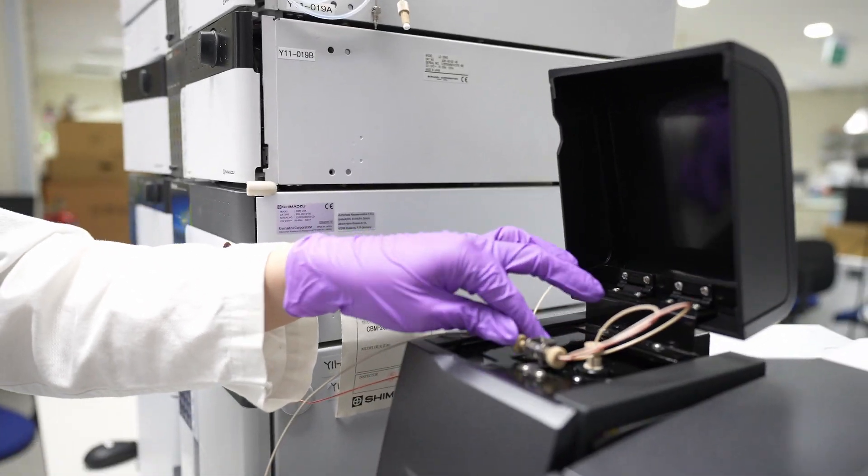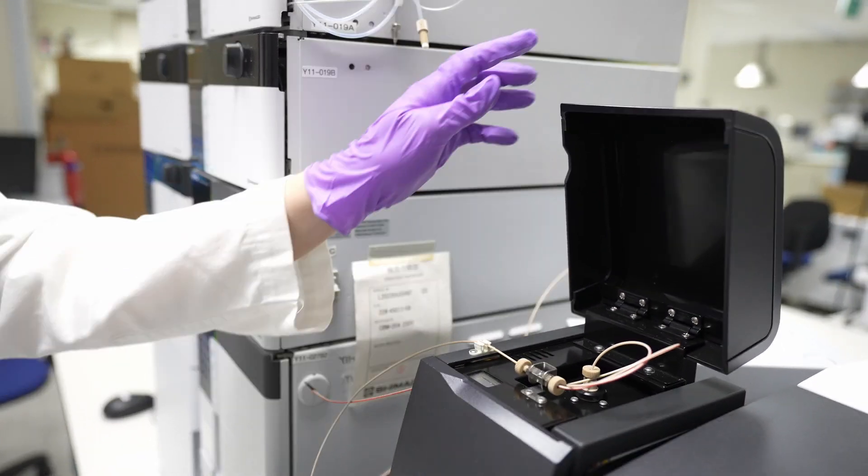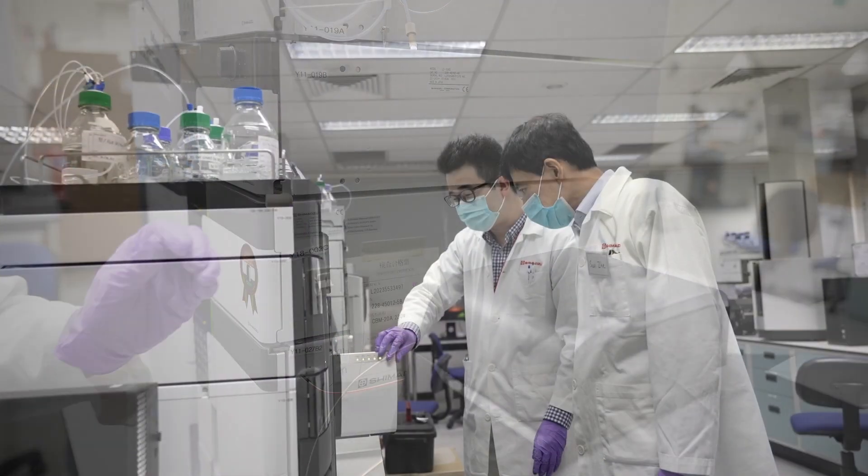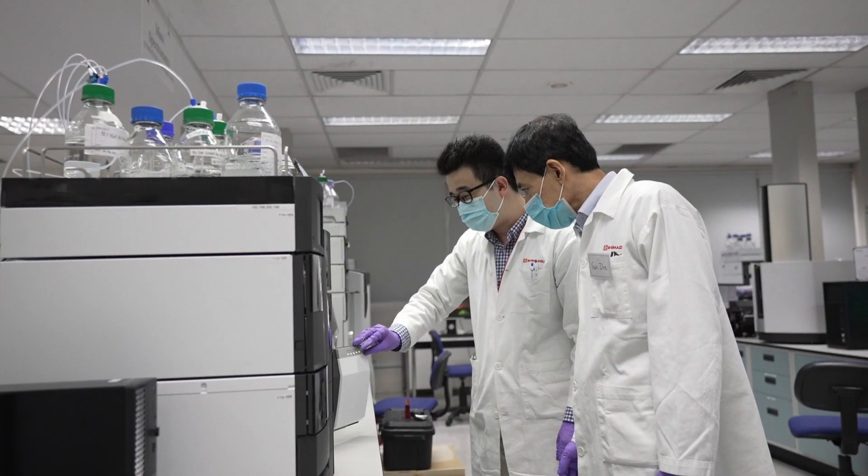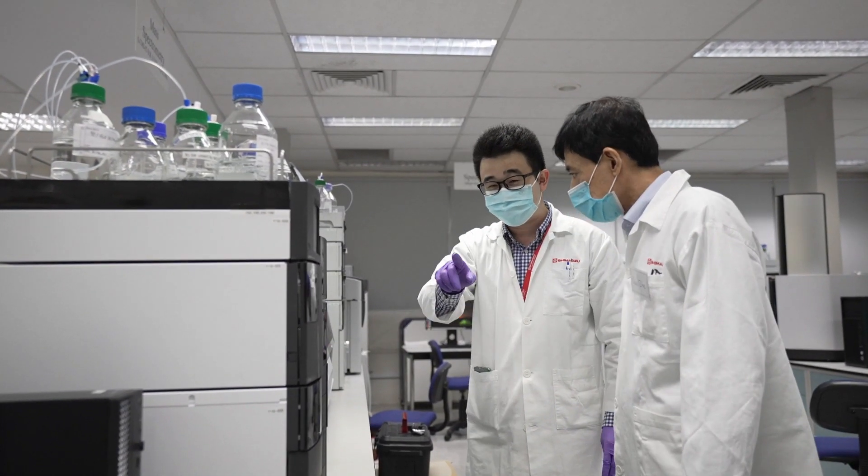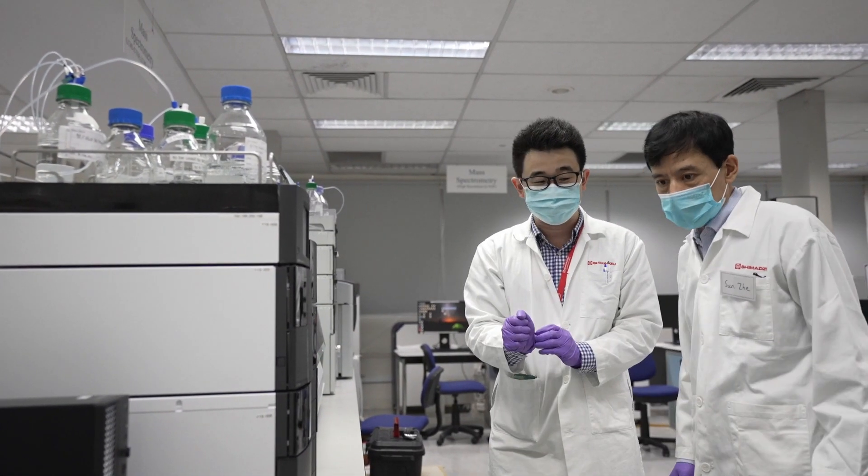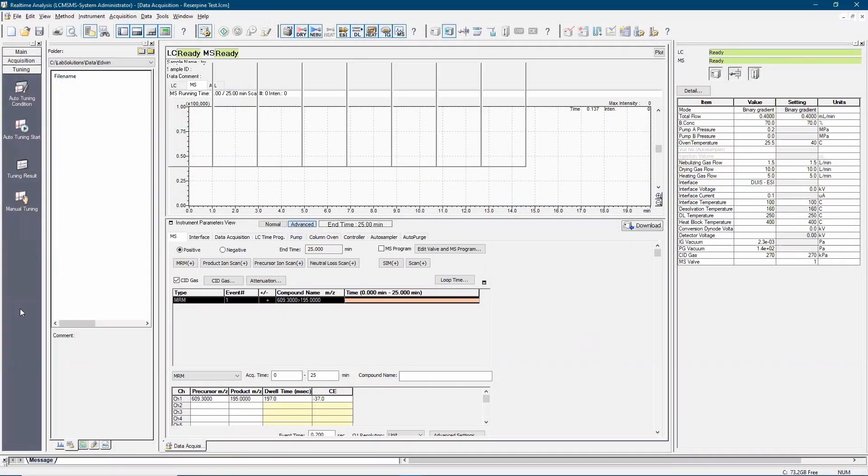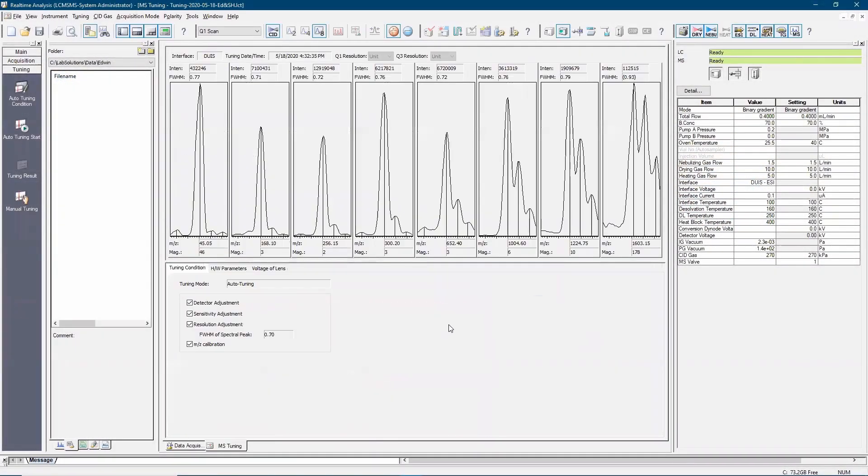Now go in LabSolution software and click tuning icon on the assistance bar which is located on the left of the window. Now, click on manual tuning icon on the assistant bar and click standard sample icon on the top tool bar.